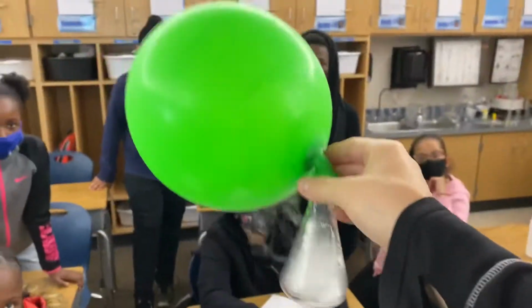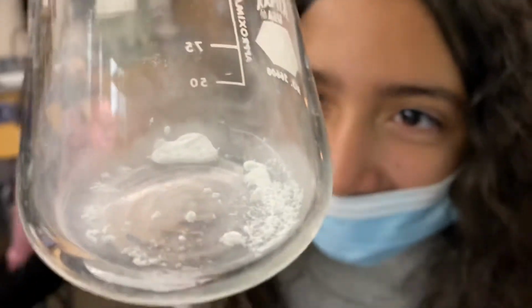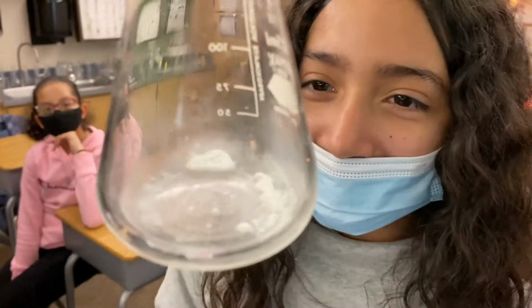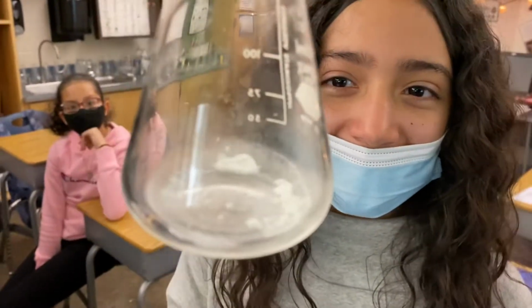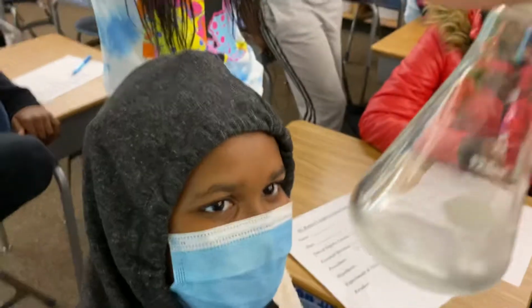Yeah, and now look at the balloon. It's inflating all by itself. Take a look at the dry ice chunks down inside the flask. Look at that. Isn't that crazy? Now, Mia, what's going to happen to those chunks? They're going to evaporate, right? Yeah. All those chunks. Do you see the chunks? Yeah. Right there. Yeah, you're touching one.